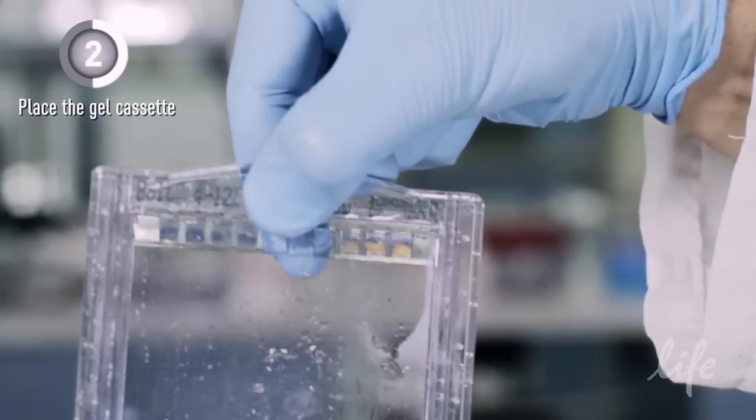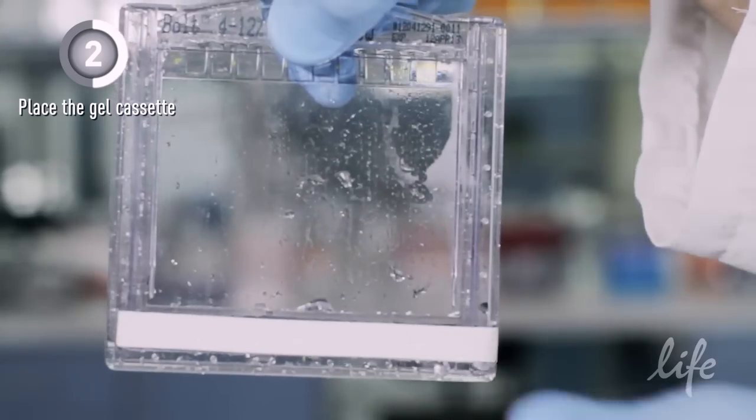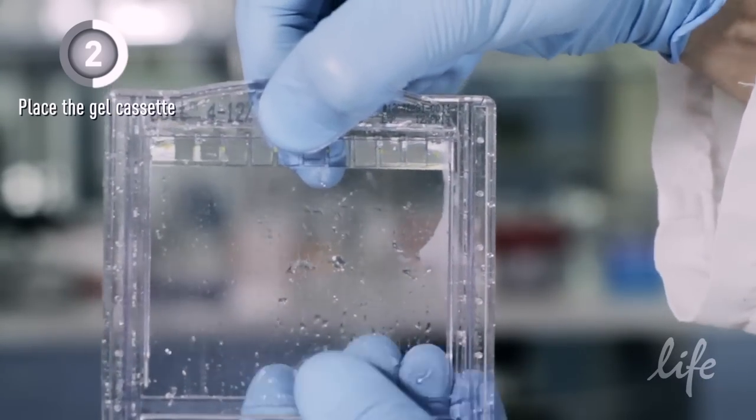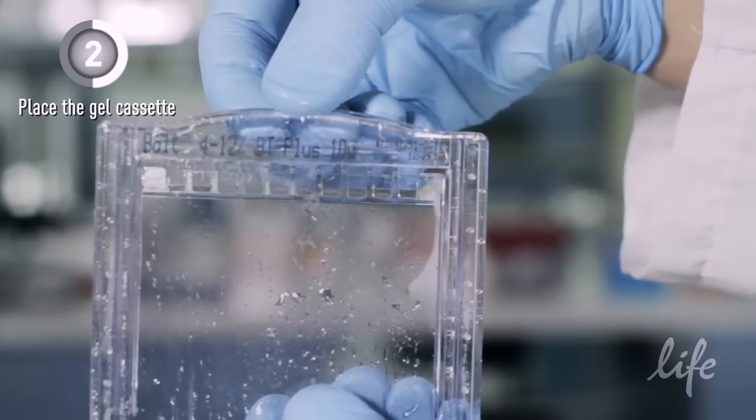Next, remove the gel cassette from the plastic pouch. Remove the tape at the bottom of the gel cassette, and then remove the comb by sliding it one side at a time.